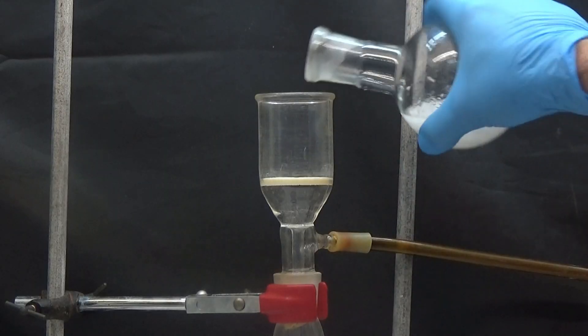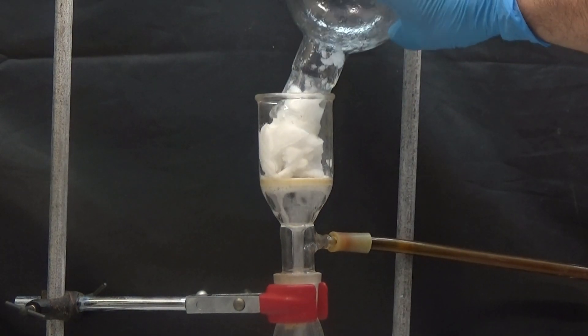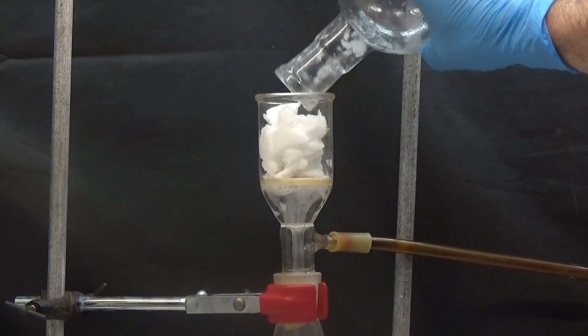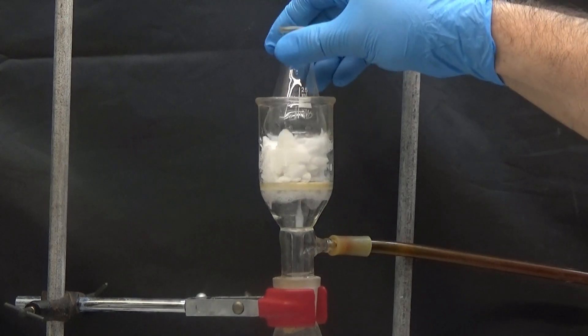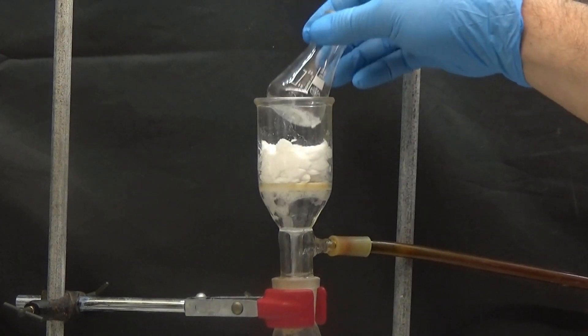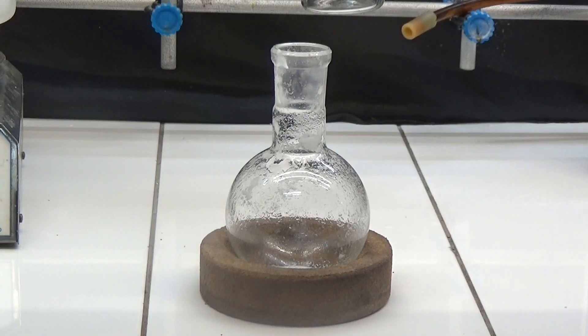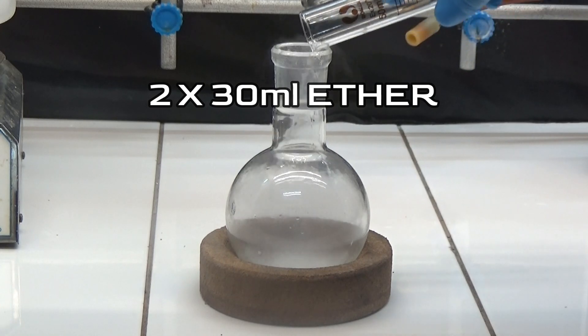The white solid is collected by suction and then compacted by pressing it. We use twice 30 milliliters of ether to wash both the flask and the solid in the funnel twice.